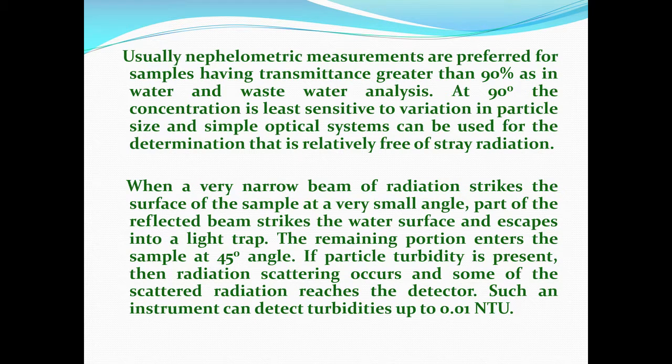On the other hand, for nephelometry there may be a dedicated instrument available whenever you need one. So, normally spectrophotometric cells are also made to be useful for nephelometry.